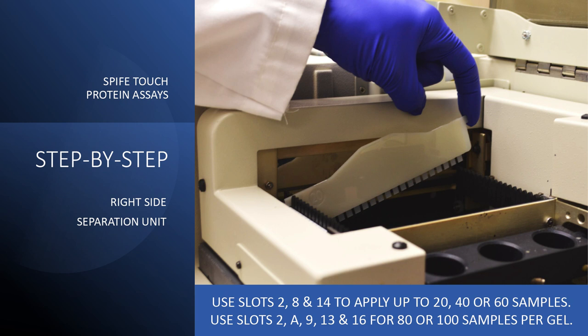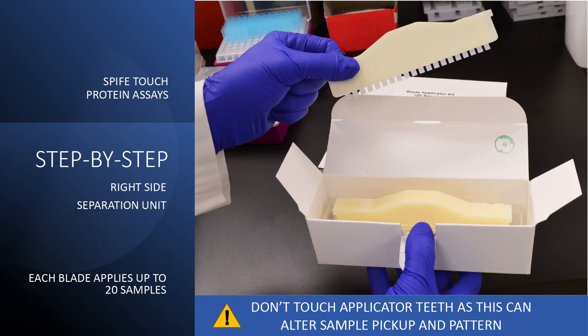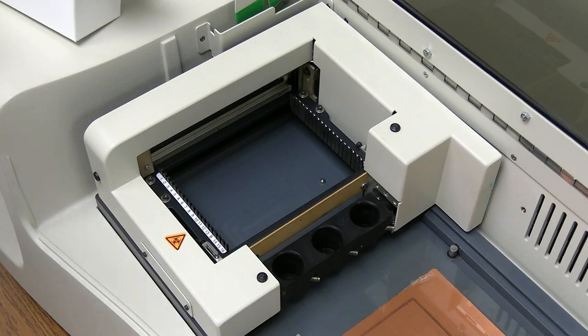Gel processing begins with the setup of the separation unit with sample blade applicators. Each blade applies up to 20 samples. The quantity and placement of blades needed is predicated by the number of samples being processed. Be sure that you do not touch the plastic teeth of the applicator blades, as this may impact sample pickup and consequently the sample patterns.